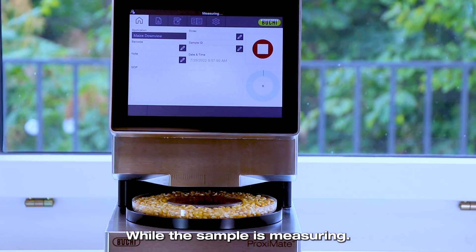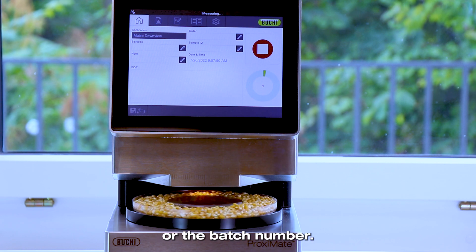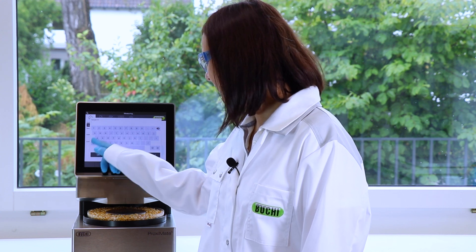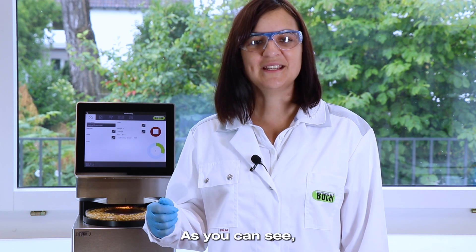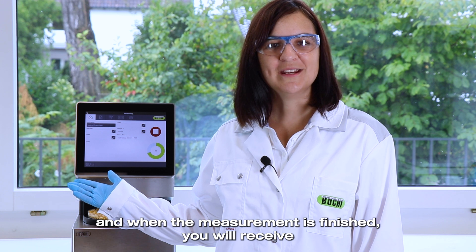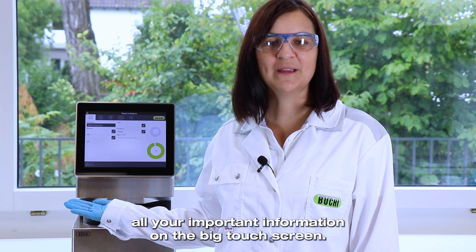While the sample is measuring, we have enough time to enter information such as the sample ID or the batch number. As you can see, the instrument can even be operated with gloves. And when the measurement is finished, you will receive all your important information on the big touchscreen.